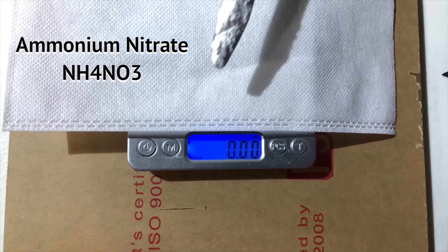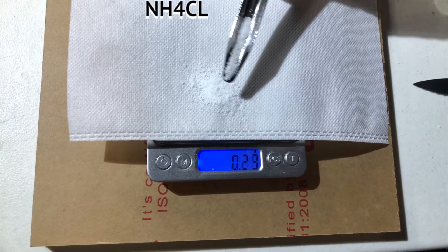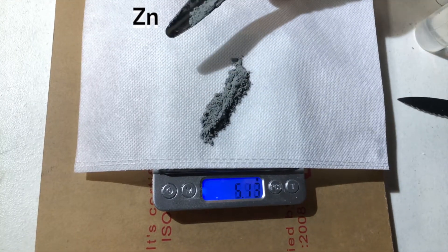Using a measuring tool, we're going to isolate three grams of ammonium nitrate, 0.5 grams of ammonium chloride, and seven grams of zinc.